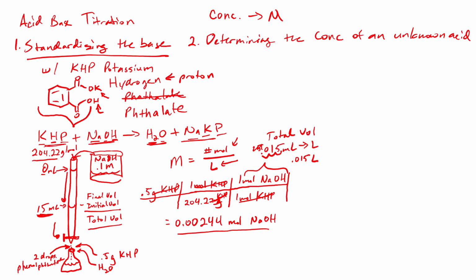Good stuff. Because now you can say molarity equals the number of moles of sodium hydroxide, which here is 0.00244 moles of NaOH, and then divide that by the 0.015 liters of the sodium hydroxide that you put into the flask. So you do that calculation.